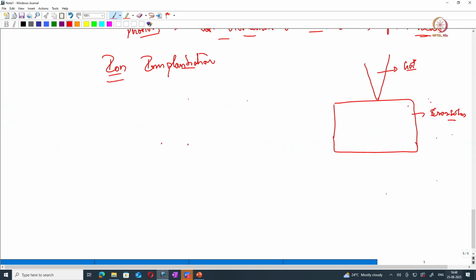They can travel into the sample until they lose all the energy. If they lose the energy inside the sample, these gallium plus ions will remain in the sample. This is called ion implantation. Usually the gallium ions can implant up to a thickness of around 10 to 12 nanometers. So gallium ion penetration depth is around 10 to 12 nanometers.